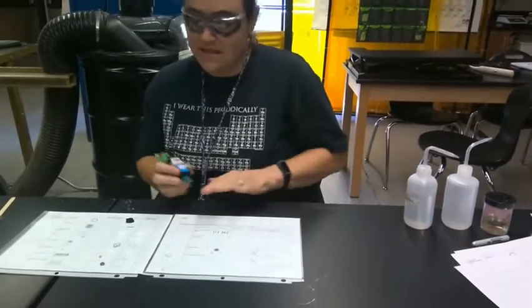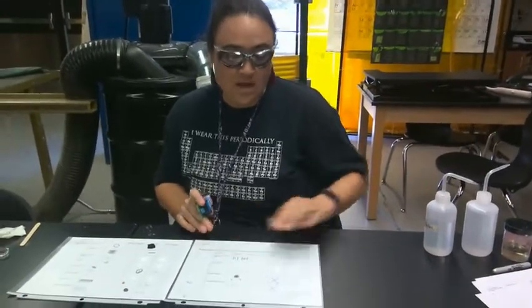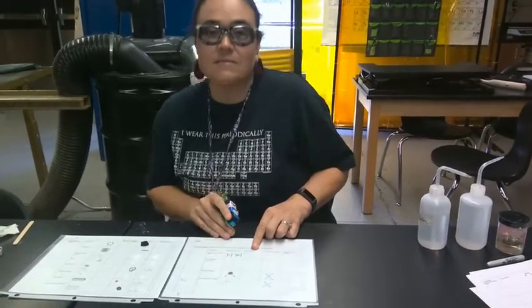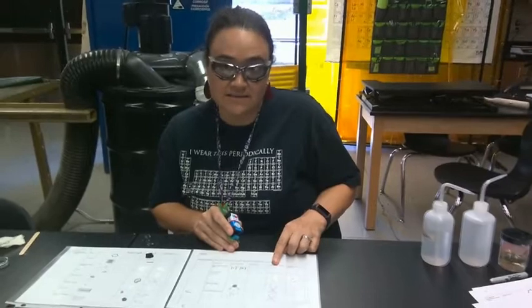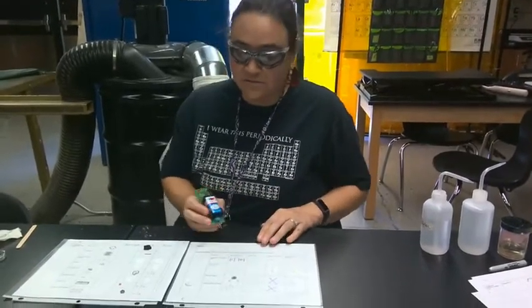You can see that there is a copy of your lab book pages here on the table and a protective cover. The first column is bond type. We're going to skip that for now. That's going to be for you to determine based on our class discussion after you test the conductivity as a solid and in solution. So let's get started.